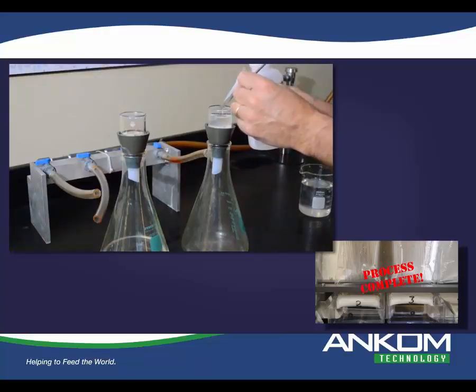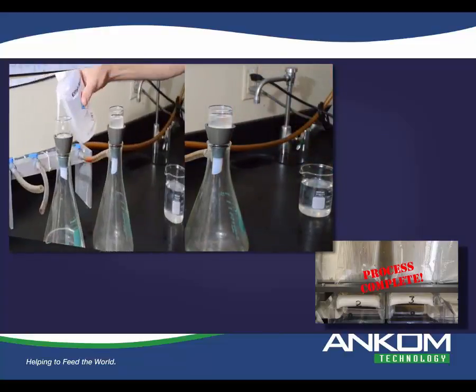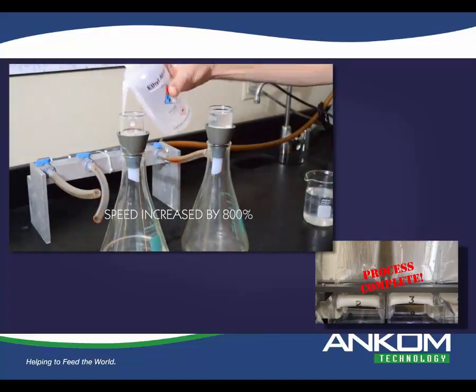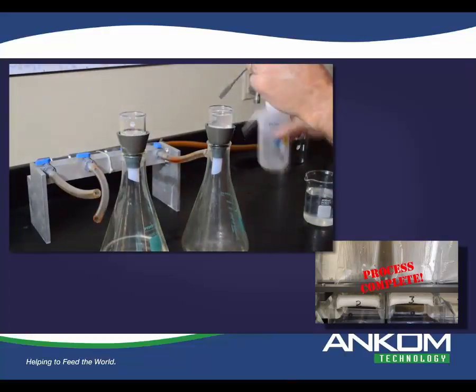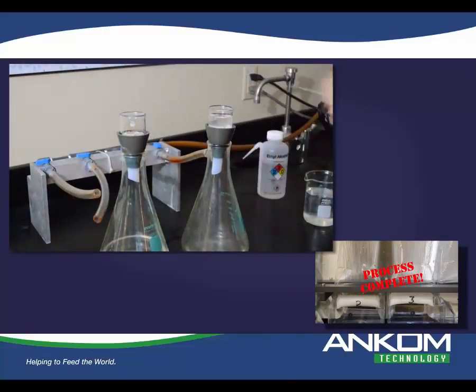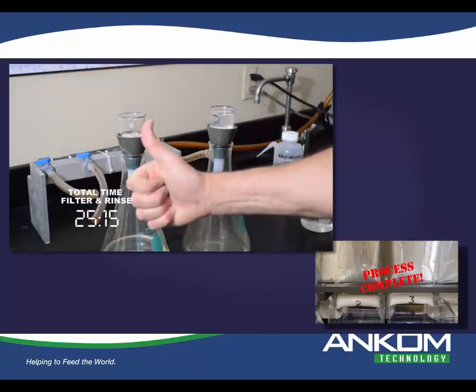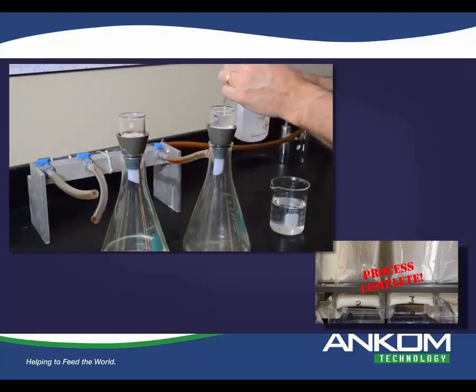I was at another laboratory that showed me their method that they had videoed using a system that still uses crucibles with the diatomaceous earth. The thing that amazed me is when they put the filtrate container on the fritted glass crucible, they actually picked it up off of the vacuum manifold and shook it. So they were dispersing the diatomaceous earth throughout all the solution. Boy, it filtered pretty quickly. That was pretty nice.